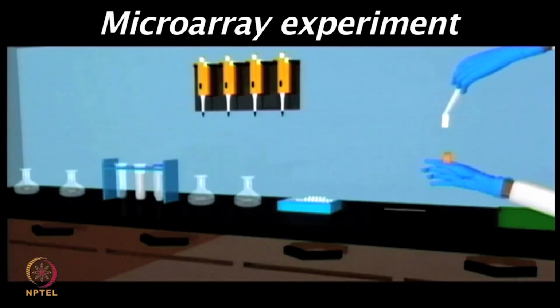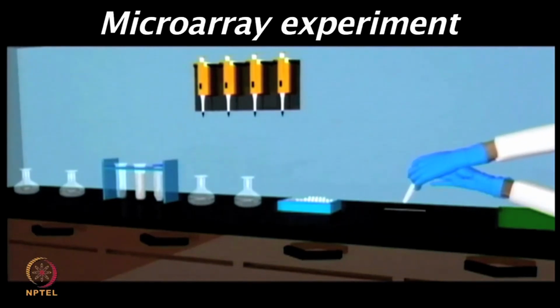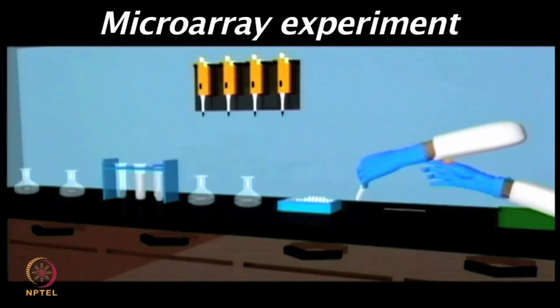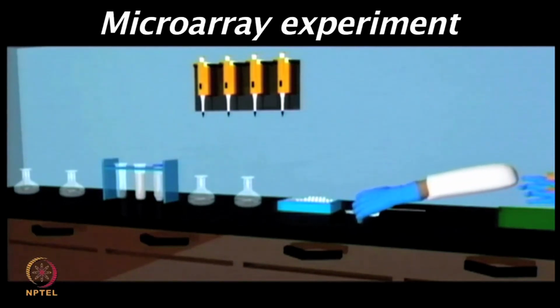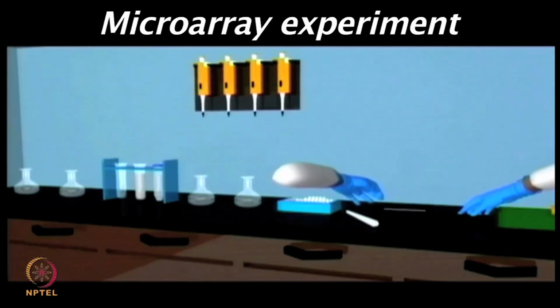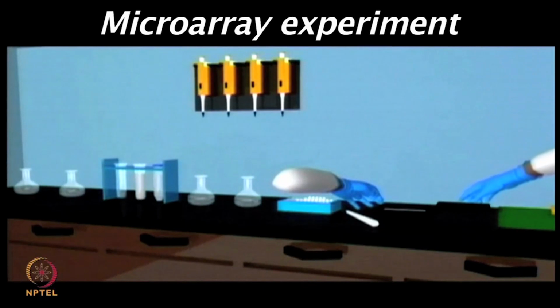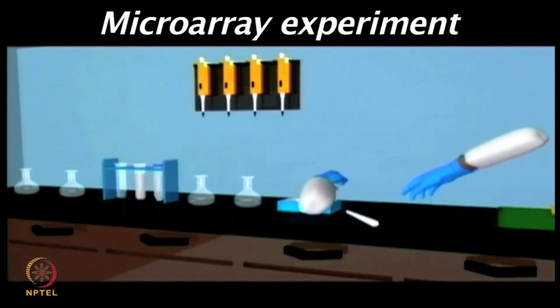Now, typically blocking can be performed at room temperature for an hour on a rocking shaker, or it can be performed at 4 degrees overnight in cold conditions. A small pipette tip box can even be used for this purpose, where you can add the super block or the blocking solution and then immerse the slide.